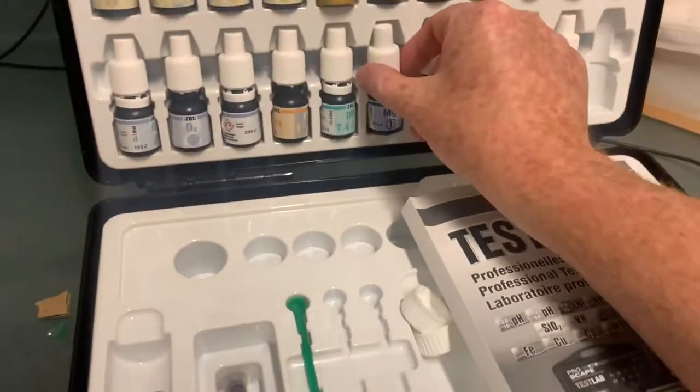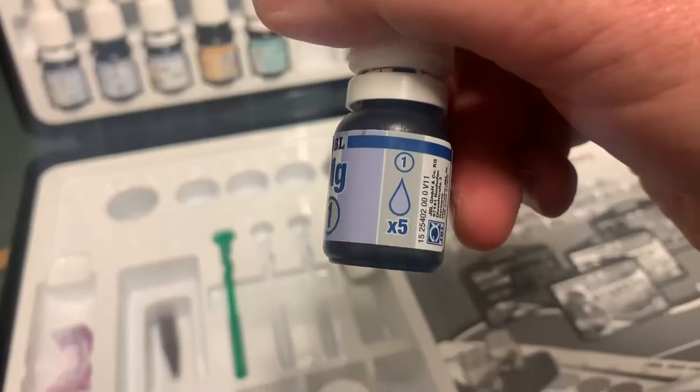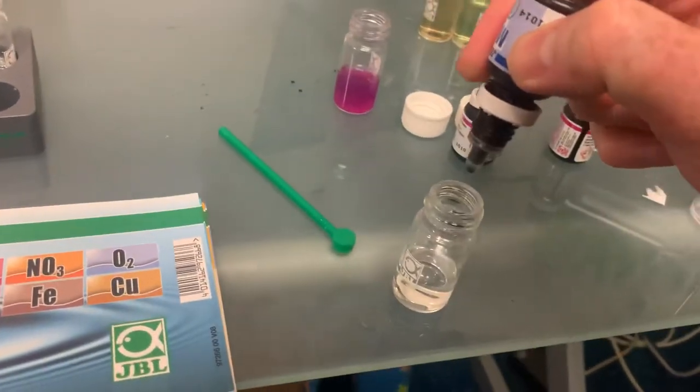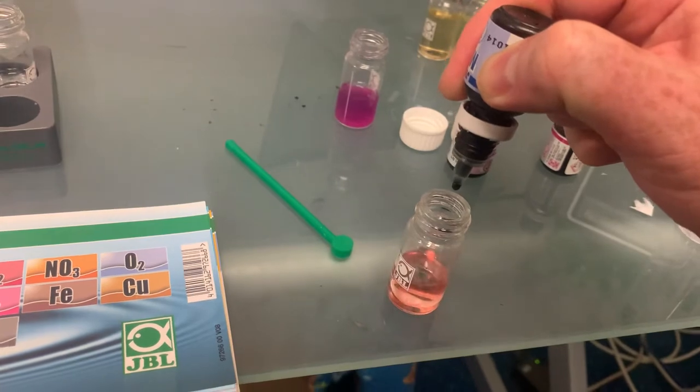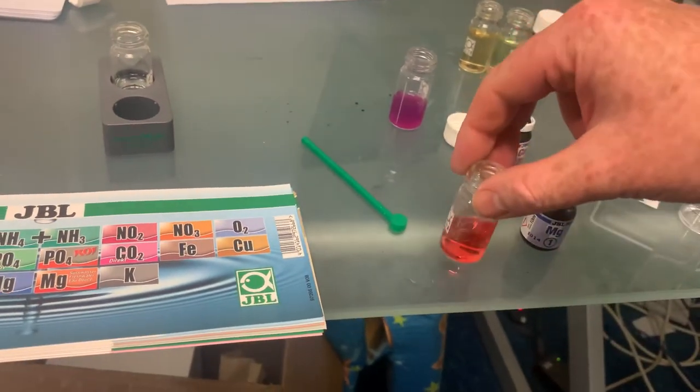Then I need to get Magnesium 1 and I'm going to put in five drops — one, two, three, four, five. Give that a shaky shake. The next thing I'm going to do is get Magnesium 2.